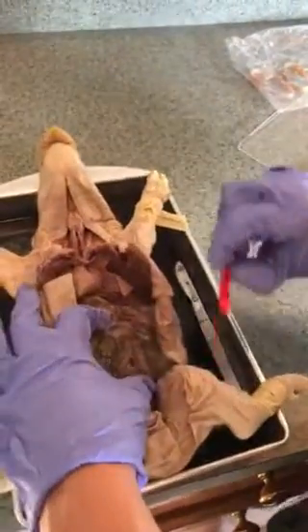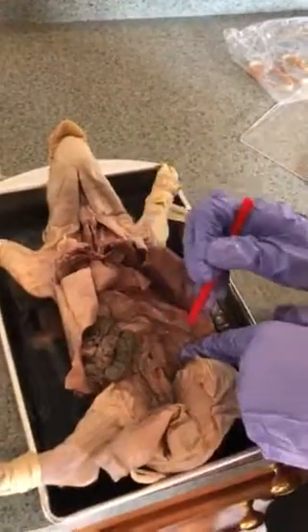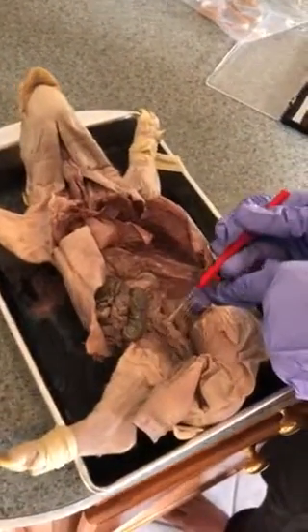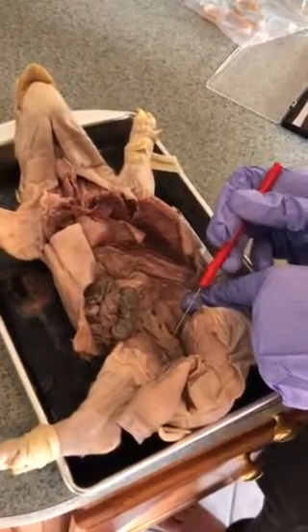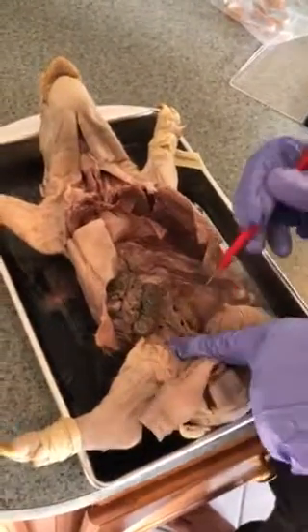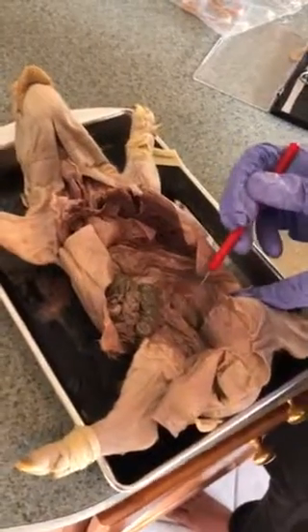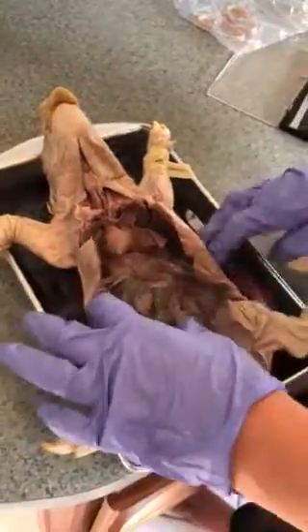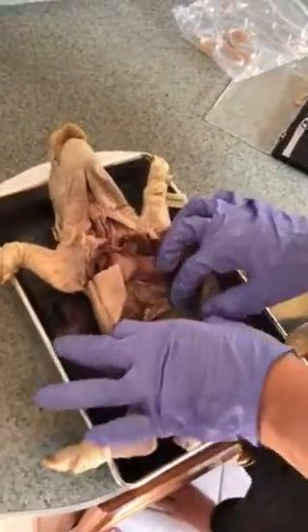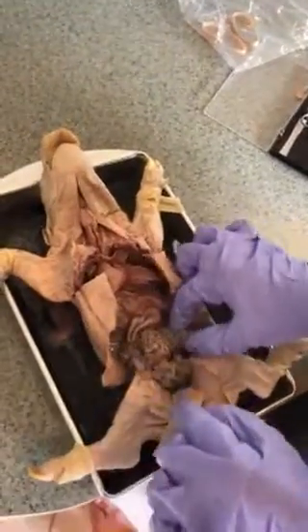And connected to the kidney is the ureter, which is right here. It's kind of covered in some lining, but you can see it connects the kidney to the bladder. Then we have the large intestine, which is right here.